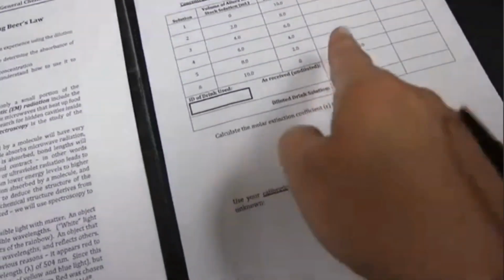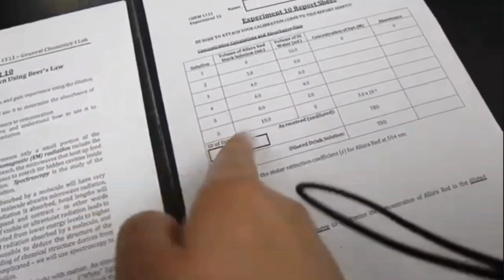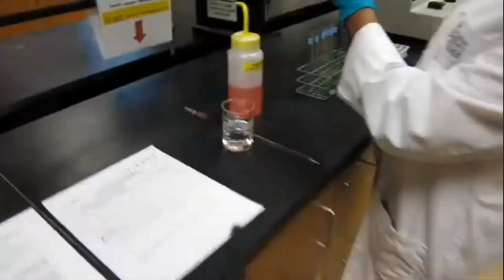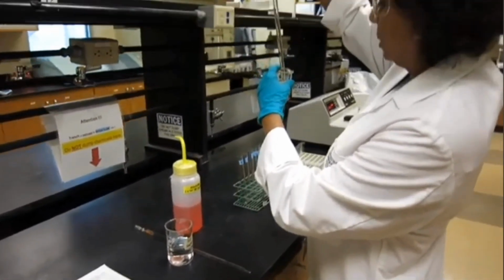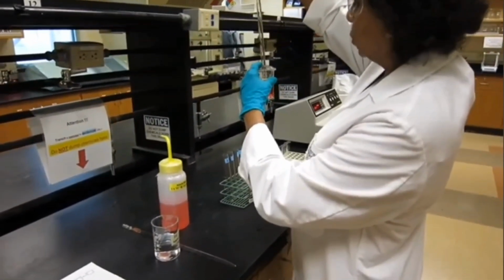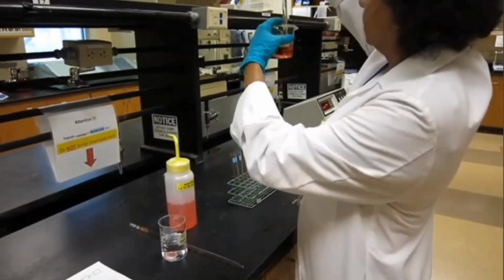First, we will go ahead and prepare our solutions for the calibration curve. You will be given this handout, and we're going to be having 6 solutions prepared for our calibration curve.